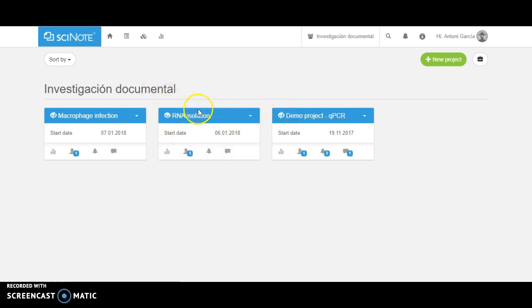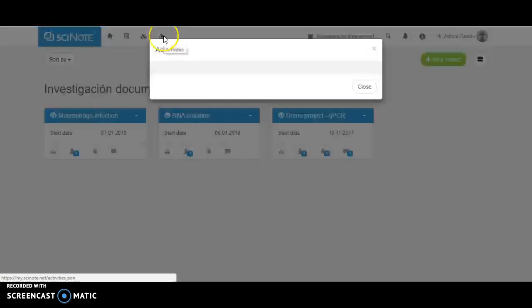And finally, to see the recent activity of the group, click on the following icon.